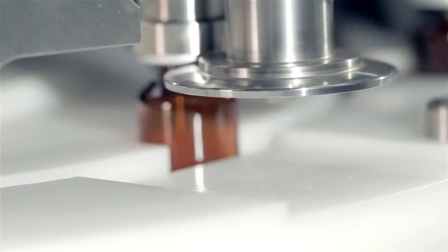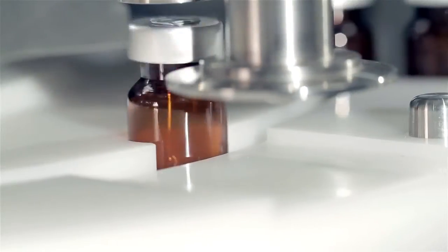The filling and capping line is very compact, configured using standard modules and proven technology.